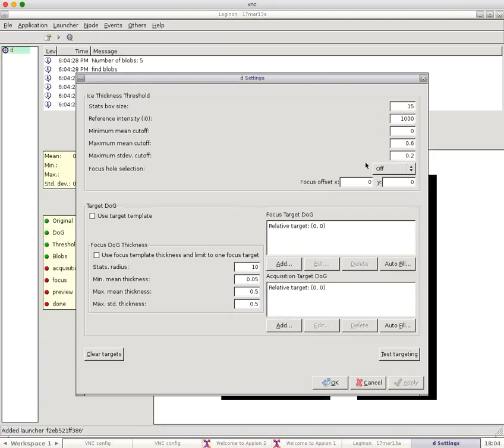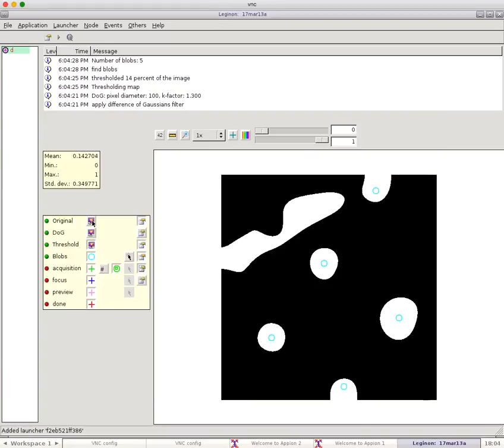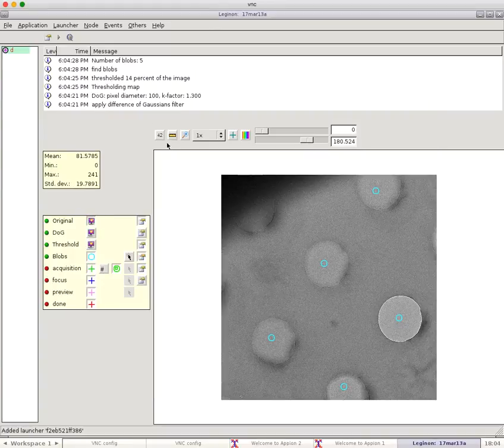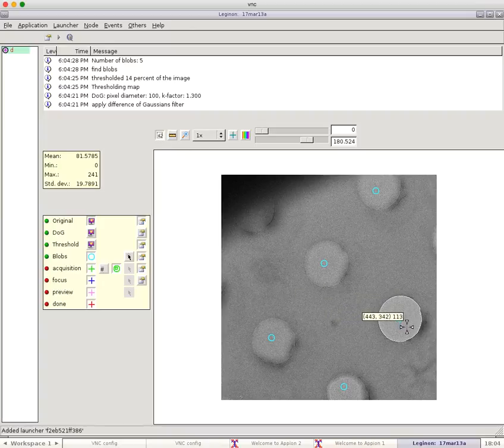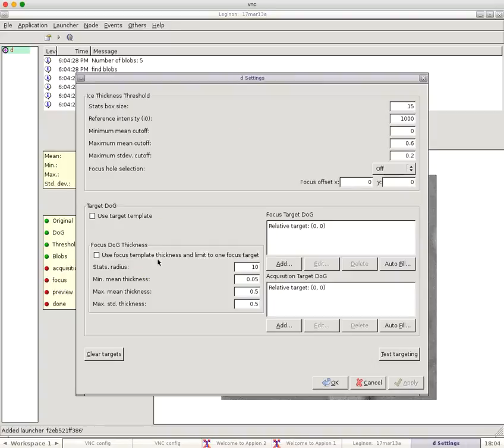Then I can go to the acquisition node, and one of the key things you need to know for the acquisition node is the reference intensity. So let's go back to our regular image, click on the 42 to get the number. You can see the empty hole intensity is around 110 or so. So let's enter that number in here.